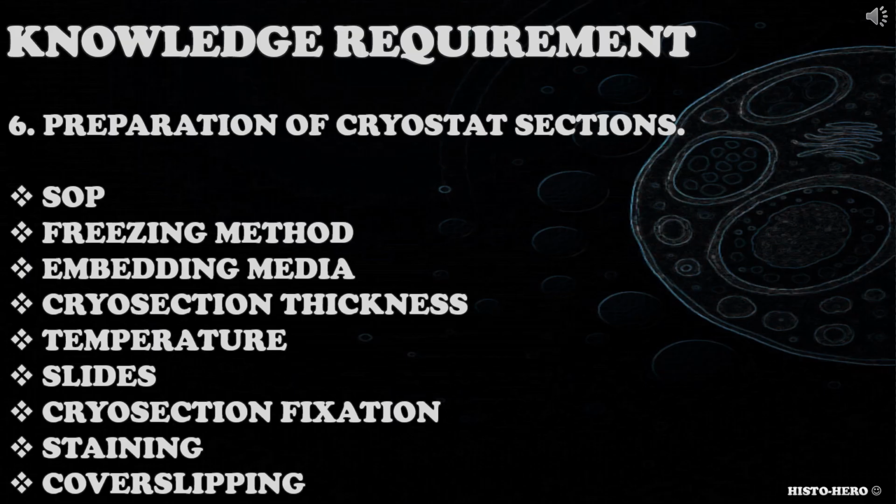When addressing this knowledge requirement, candidates should consider SOPs and methodology used, freezing methods, embedding media, thickness of cryosection, temperature, types of slides used, fixation, staining protocols used, cover slipping and so on.